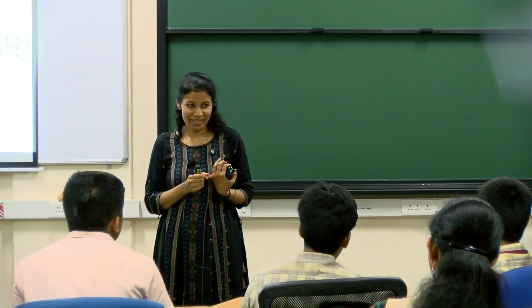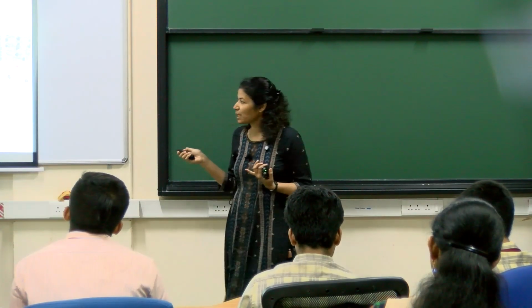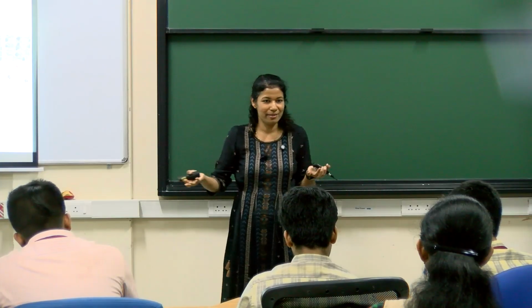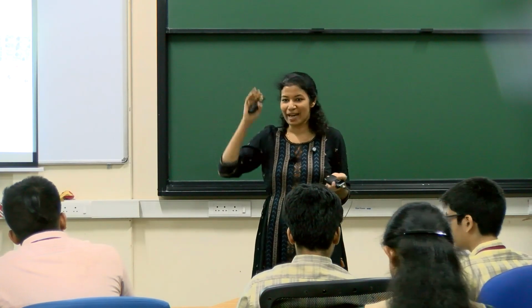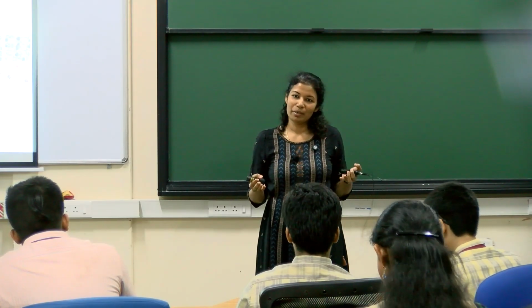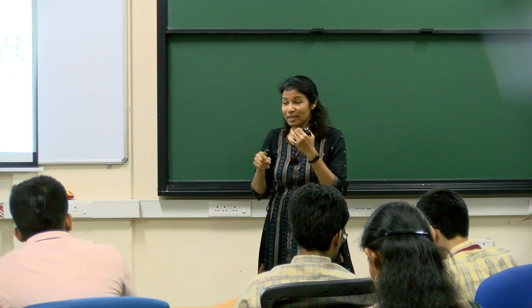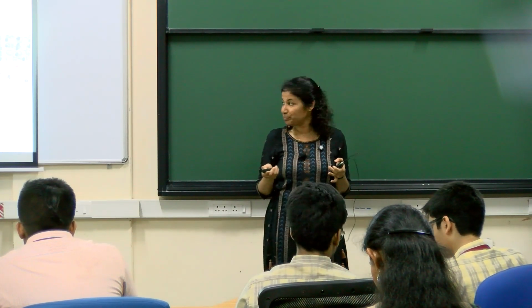Yes, so that's the exact answer actually. Theoretically you can combine 100 lenses and get a magnification of 1000 or more than that, right? But it doesn't work because there is a physical limit. So other than magnification, there is one more parameter which is important, which is the resolution.